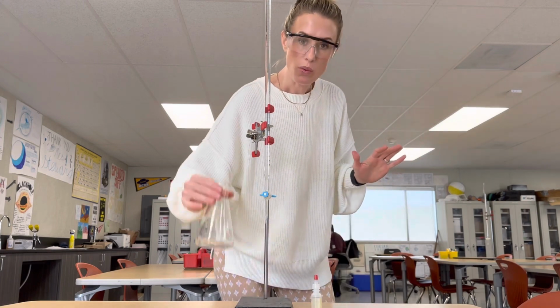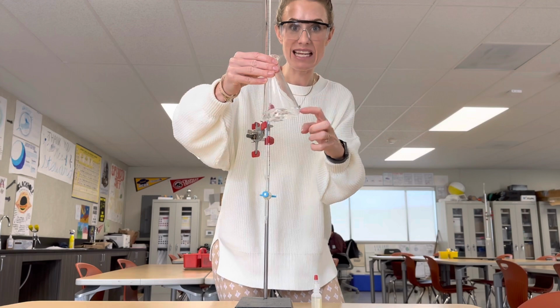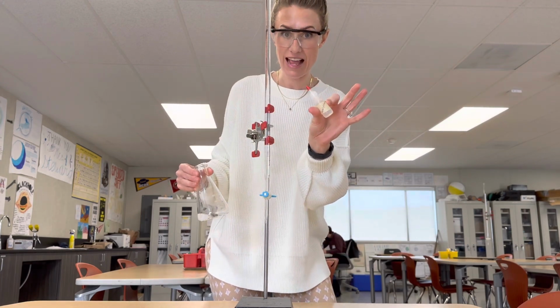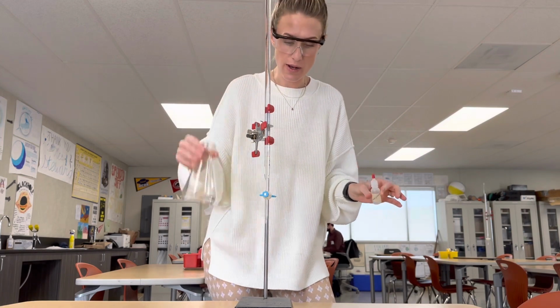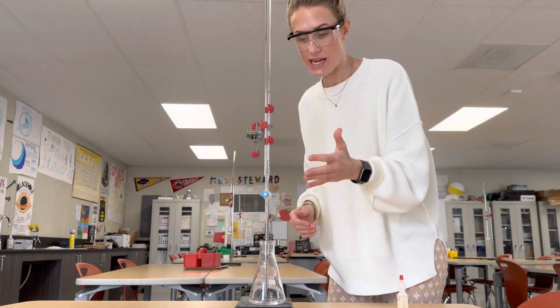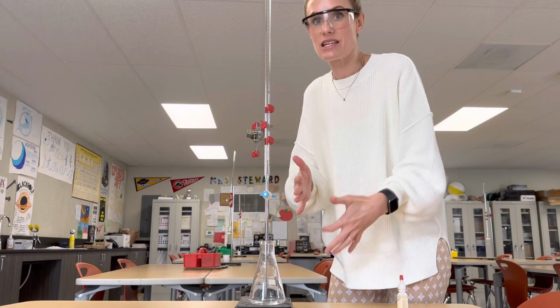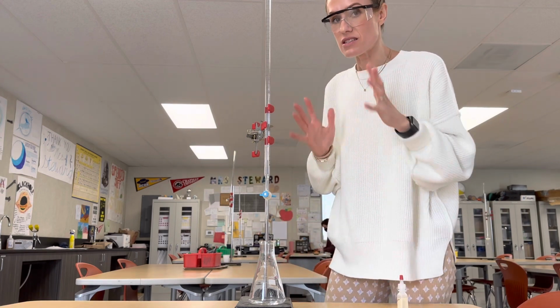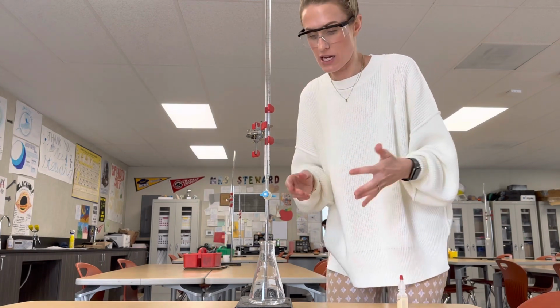Now I have my 20 milliliters of vinegar in here, which we know is diluted acetic acid. And then I've also already put 2 drops of my phenolphthalein, which is the base indicator, in this vinegar as well. So what we're gonna do is I'm going to drip some of this base into my acid. And then as the base goes into the acid, the solution is going to increase in pH. Once it stops changing color, I want to stop adding my base because we've reached our neutralization point.